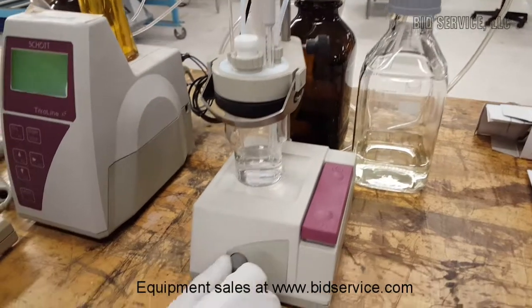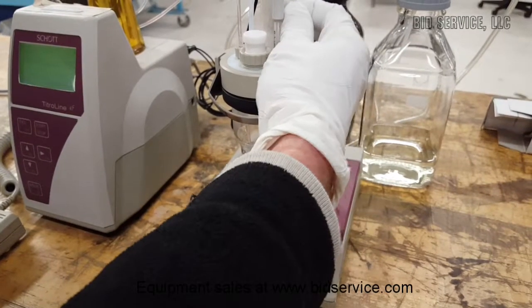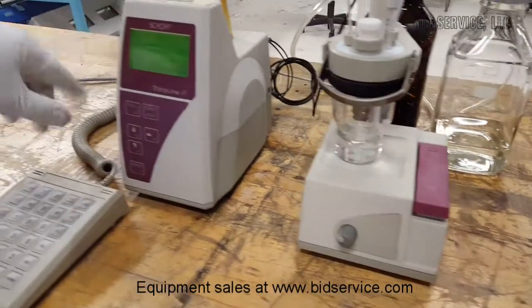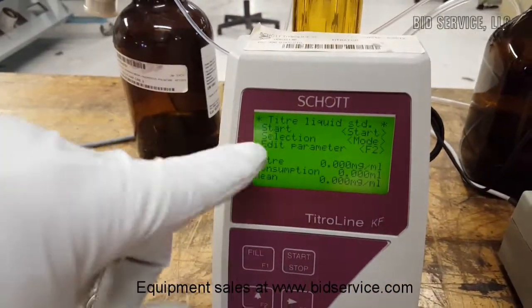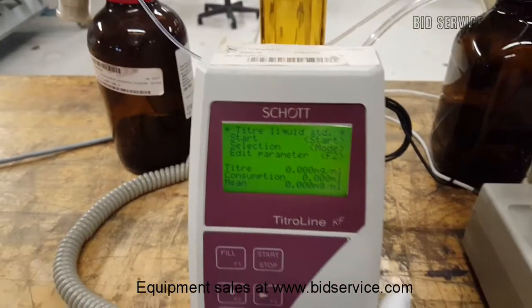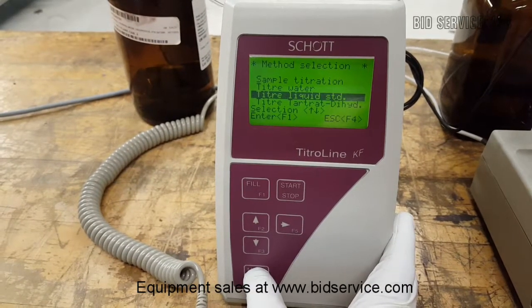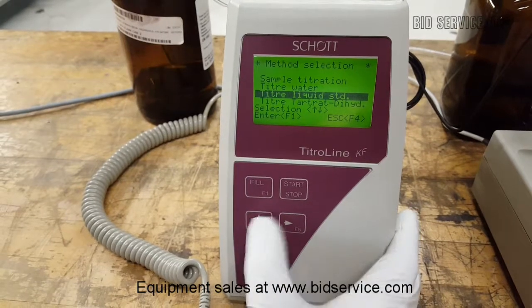Okay, and we have the stirrer in there — you can see that it will stir. I'll just pull those two bubbles a little bit. What I have programmed in here is the most programmed in the machine. We're just going to run a titer liquid sample. Let's look at the other modes available. We've got sample titration, titer water. We'll do the water.